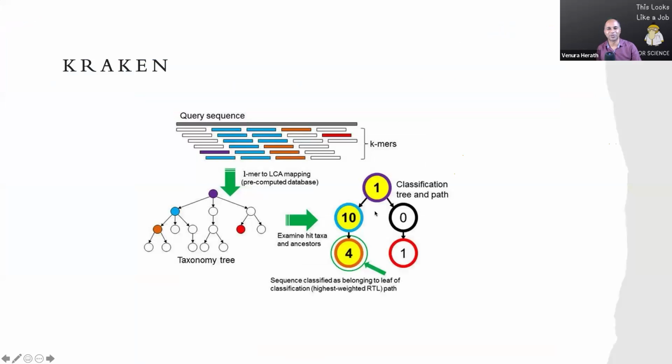Okay, so this is how you do Kraken. Remember I told you there's a query sequence, and then we match it to a pre-built taxonomic tree, and we will see how they hit different ancestors. Accordingly, we are going to build the taxonomic classification of the different taxons these trees belong to. That way we can go up to even strain level with this tool. And as I told you earlier, it's a very efficient, less energy consuming tool people use, especially for metagenomic assays as well.